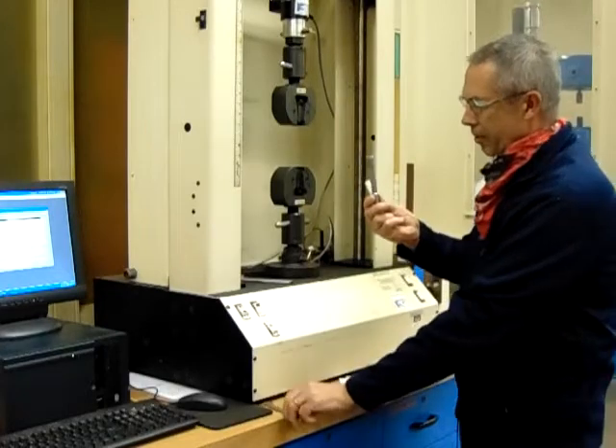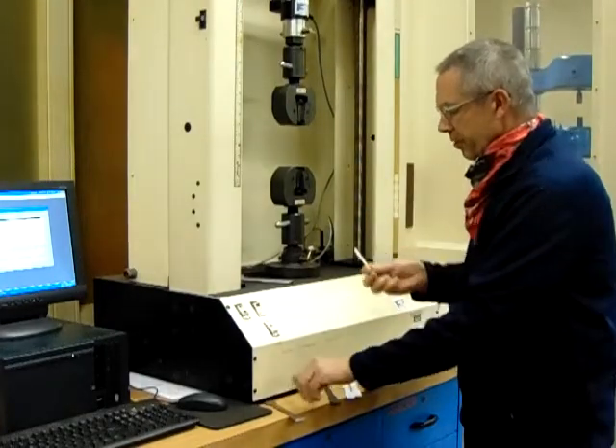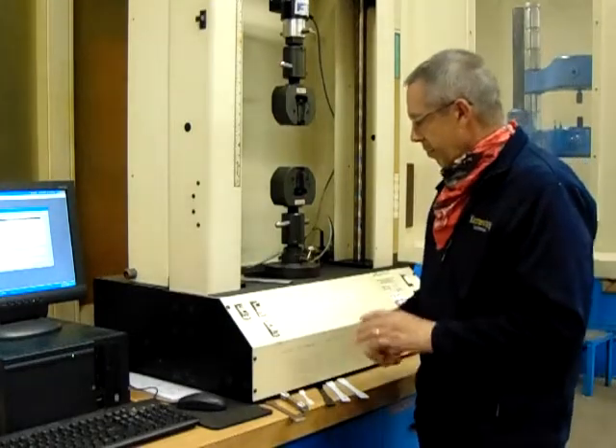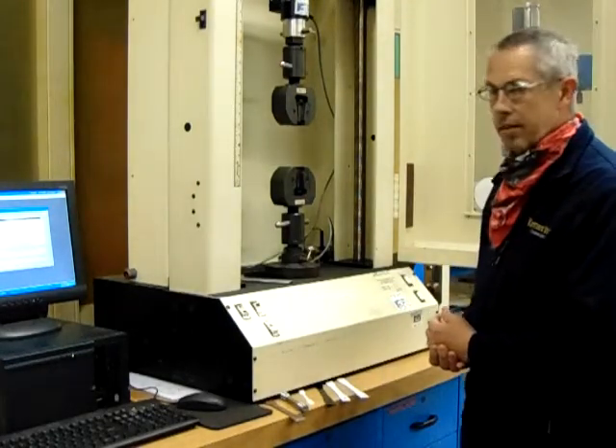We have a solid round steel, we have a flat steel bar, we have a smaller plastic. You can get the same results from the different sizes — you just need to know the cross-sectional area.